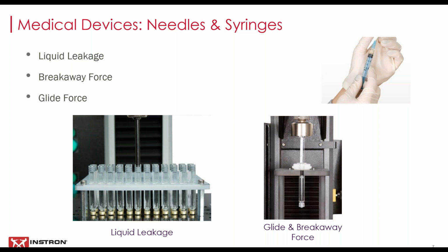There are a number of standards that provide test requirements for needles and syringes, including pre-filled syringes. An XY system can easily be adapted to run many of these tests, such as a liquid leakage test that is performed on vials, such as those seen in the photo, and on syringe closure systems, which might be a needle shield or tip cap. The test determines whether the closure system or plug can withstand possible excessive pressure inside the device during filling or shipping.